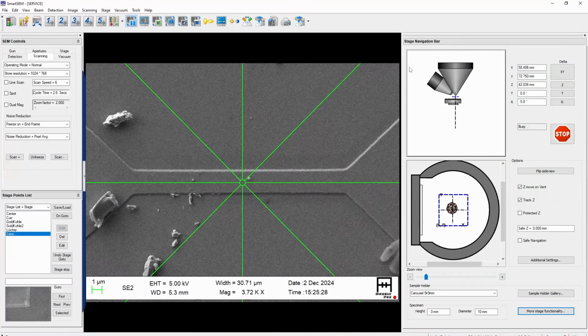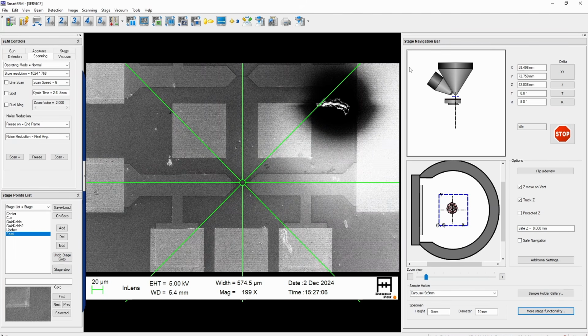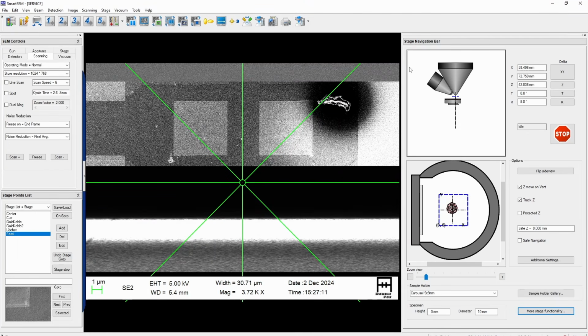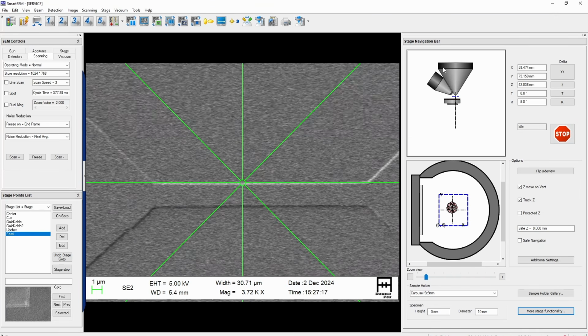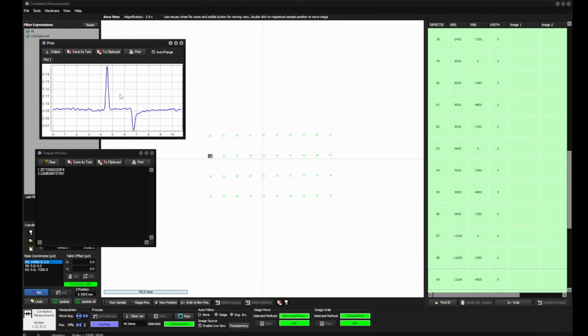And we can watch the SEM. It's recording the first image, centering the area of interest, recording the second one, storing it, and you can see in CorrMeas it has also evaluated the image and measured some width here.